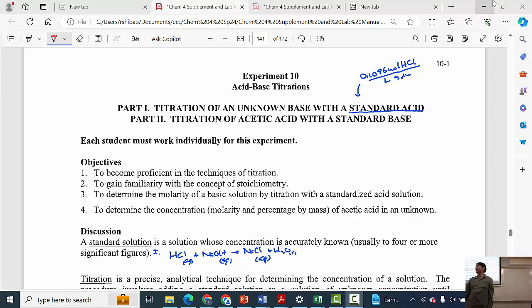And so do you know what it's going to look like? It's going to look like CCS plus CCS. What was the CCS again? Clear colorless solution. CCS plus CCS yields CCS. So can we even tell anything happened?